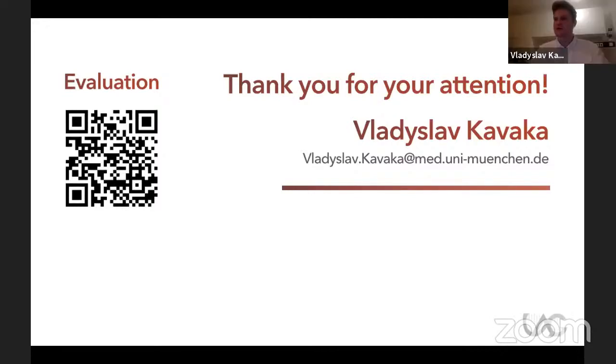There is one question in Zoom now. Where do you check that public data? I think that the best way to check it would be to look into the publication. There are a lot of publications that share their data on public repositories, like GEO datasets. That is where you can find a lot of public datasets published and uploaded. Yeah, EGA or GEO are the best ones.